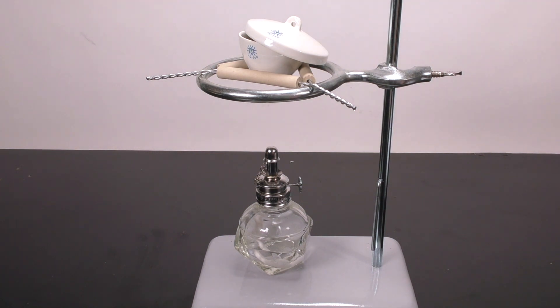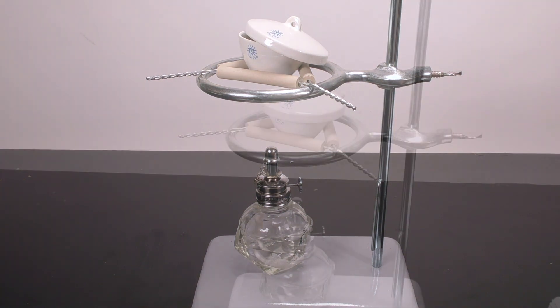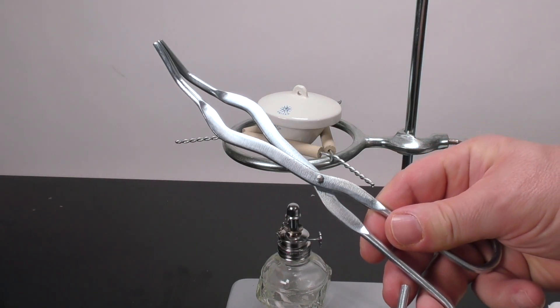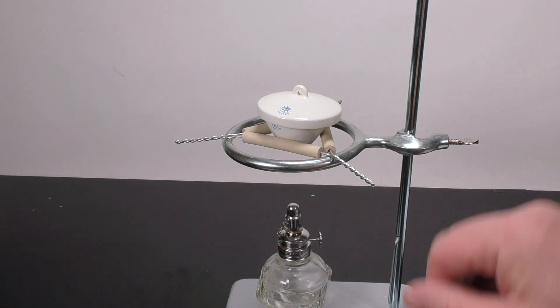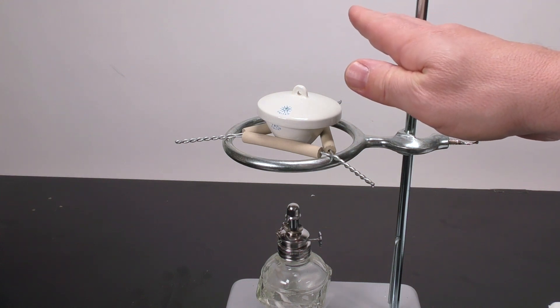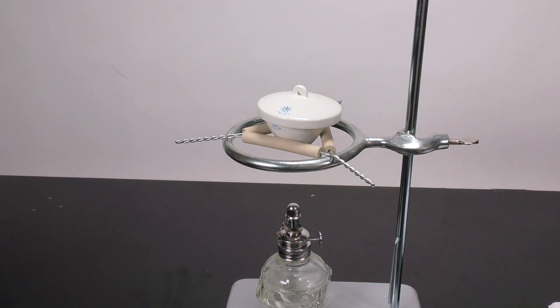Then let it sit and become completely cool before you do your main experiment. No matter what experiment you are doing, always remember to use the crucible tongs. Never ever touch the crucible no matter how cool you think it is. Always practice safe laboratory procedures.